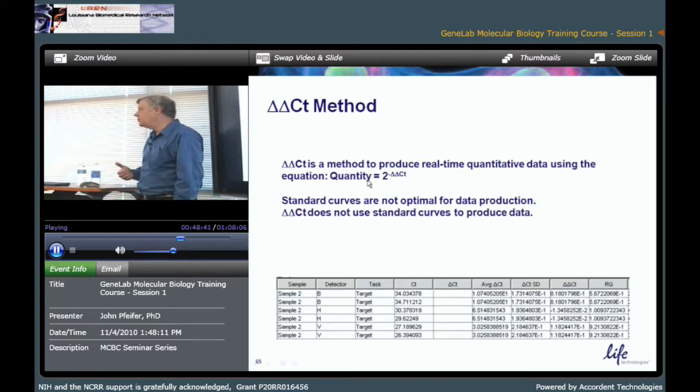What type of sample would you be extracting the virus from? Let's say infected cells. Great. Human? Let's say, simply not an RNA virus, but a DNA virus. DNA virus. Okay, great. Like adeno, perhaps? Yeah. Beautiful. In fact, I've been working with some of those assays recently. So would you like then to have the results as copies of adenovirus per copy of human DNA? Would that be reasonable? Or human cell number? We could do that, or even total absolute number.